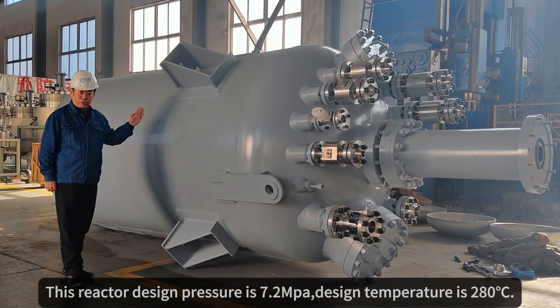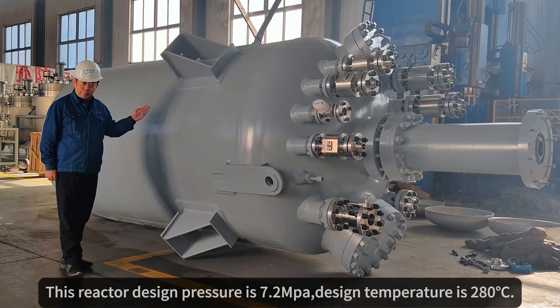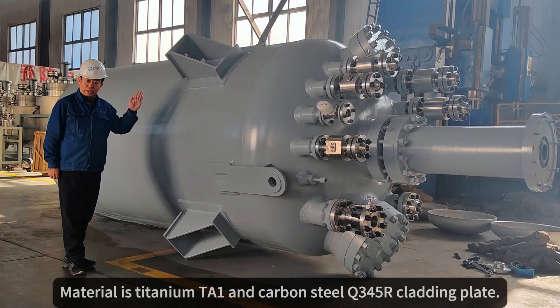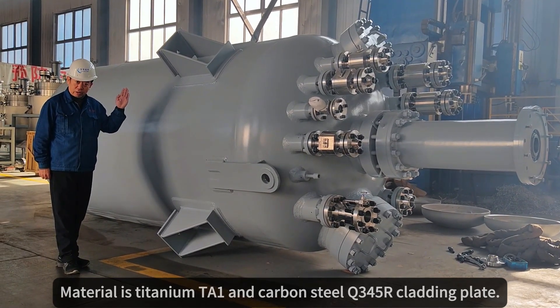This reactor's design pressure is 7.2 MPa. Design temperature is 280 degrees. Material is Titanium TA1 and Carbon Steel Q345R cladding plate.